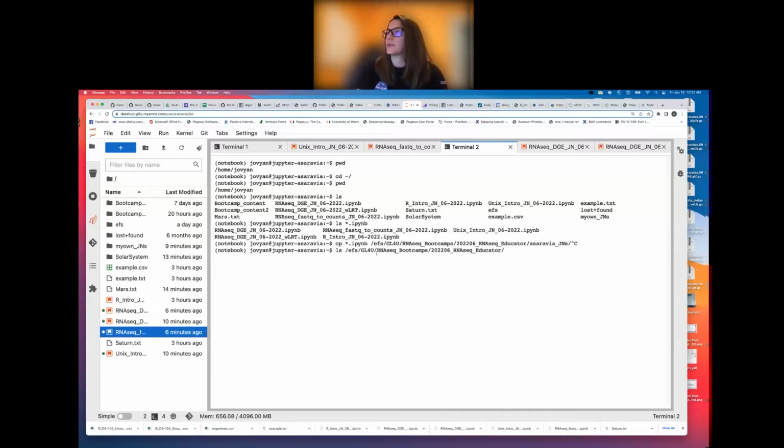Do you guys remember what the option is for ls to list in a single file? Yeah, Susie. ls -1, and then I'm listing everything that comes before your name. Let me copy and paste this command in the chat so you guys can do this too.